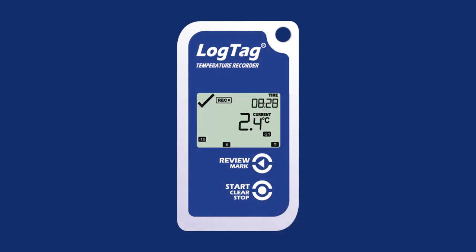If the logger is configured to stop when the Start Clear Stop button is pressed, press and hold the Start Clear Stop button until stop displays on the screen and recording disappears. Once the logger has stopped recording, the latest temperature taken will disappear.